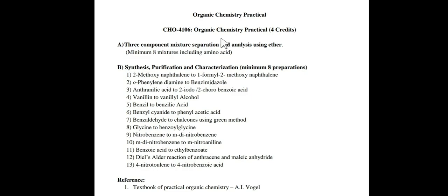The first experiment is a three component mixture separation, that is a ternary mixture separation, which we will cover around 8 mixtures. And the second part of our practical is all about the synthesis, purification and characterization of simple one stage or single stage preparations or reactions. Among these 13 reactions we need to cover minimum 8 preparations. So I will cover 4 of these experiments.